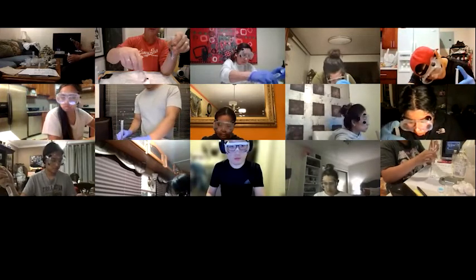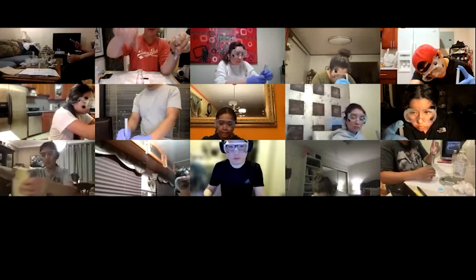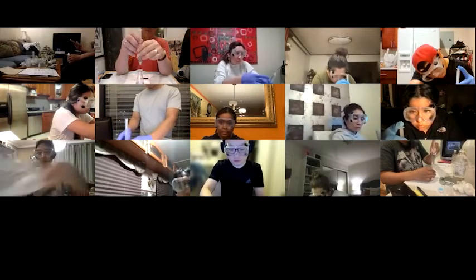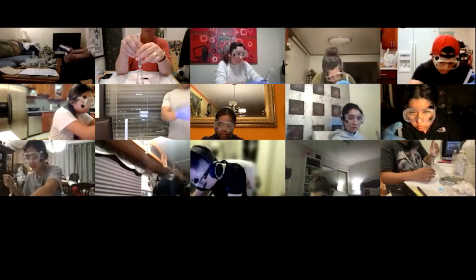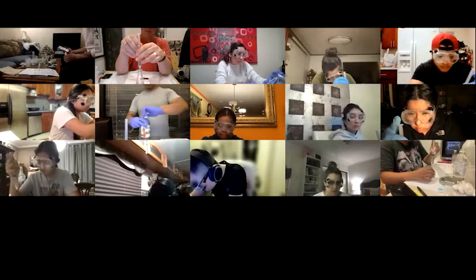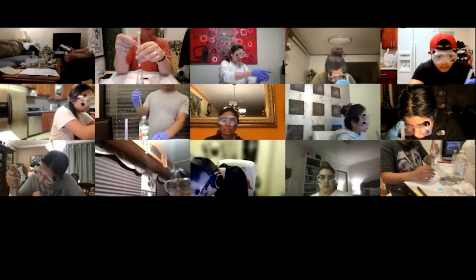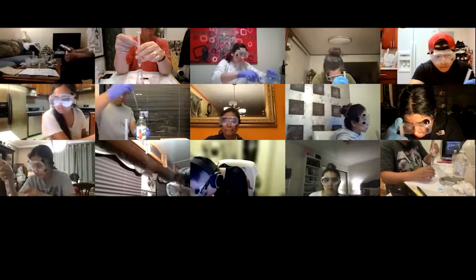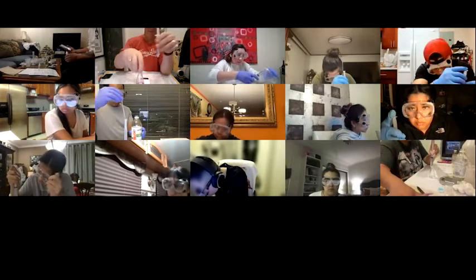Yeah, you'll notice as you get further and further along, did anyone notice that the more base you use, the longer it takes to disappear when you swirl it? That's what you're looking for. If you just gently push from the base of the plunger, you can just add small drops at a time. So what we're looking for is that pale pink color to stay. Very pale.